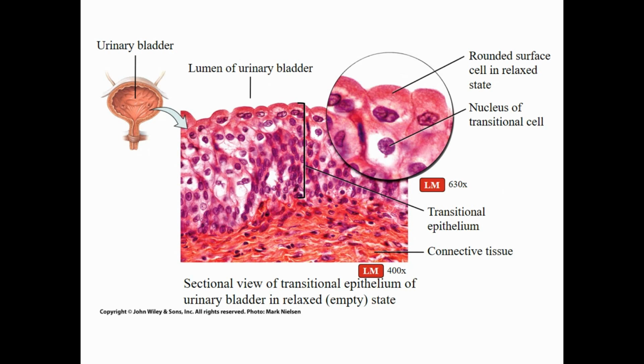Then we come to the leftover epithelial tissue, the kind that's very unique, and that is what we see in areas of great stretch. So we go to the urinary bladder. Here's your dead giveaway that we're talking about transitional epithelial tissue. So here, this bladder is not stretched, so they have a cuboidal shape, and we see multiple layers, and they're all kind of just piled up, not in a very good order. Then we recognize that as transitional epithelial tissue.